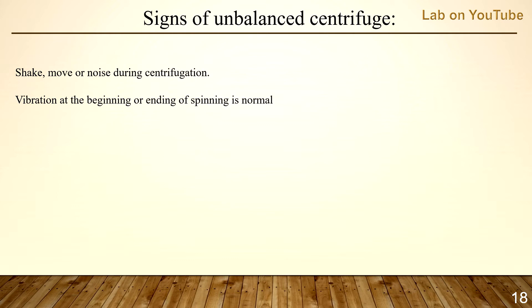Vibration at the beginning or end of spinning is normal. It occurs as the rotor passes through a so-called critical speed range where small vibrations are temporarily amplified. It won't affect separation because the centrifugal force is still high enough to stabilize them. However, a well-balanced centrifuge will minimize vibration.